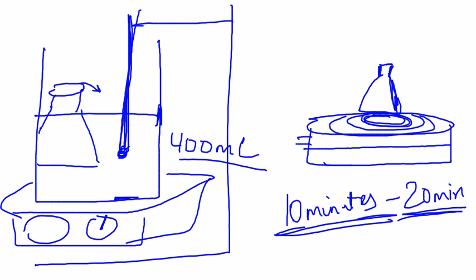One of the partners should still keep an eye on the flask, because after the 10-minute or 20-minute period, usually the precipitate starts to appear, and you are supposed to cool it at room temperature. If it's ready, just remove the heat and allow it to cool. As it cools down, the precipitate should start crystallizing, and you might have to put it in an ice bath to maximize that precipitation.